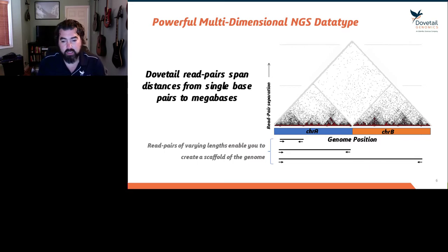than regions that don't interact. And so one of the things to point out here is that there is very little trans noise or inter-chromosomal interactions, as you can see with the big gap in between chromosome A and chromosome B. And that gap is a place that we look in our contact matrices to call inter-chromosomal translocation events.